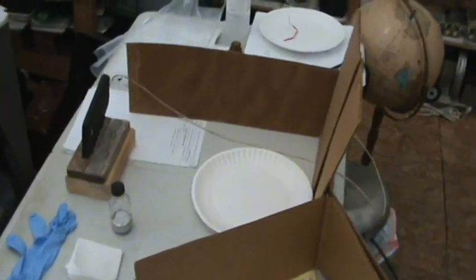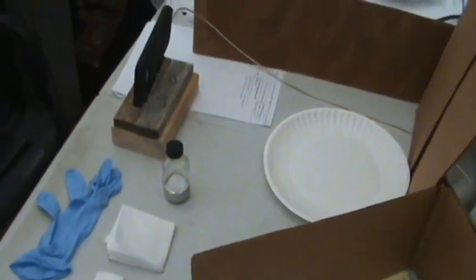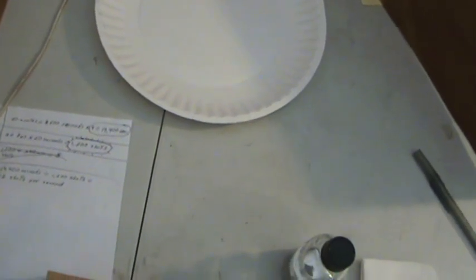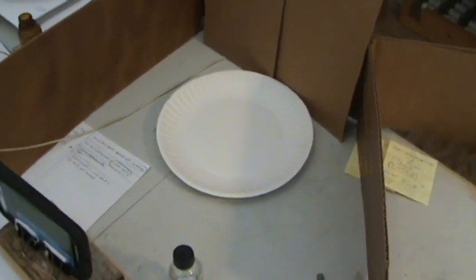Hey guys, Paul here, Inventor 3. I'm going to try to do some mercury on aluminum plate here and see if we can get this to work, get that amalgamation going — this reaction between the mercury and the aluminum plate.